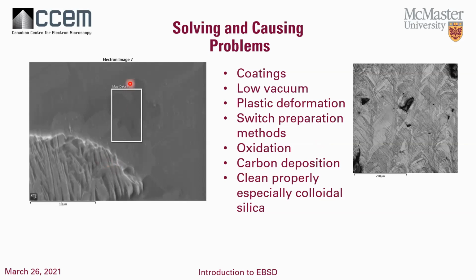oxidation. Because we are using very high accelerating voltages and currents, we will get, in most SEMs, carbon deposition.